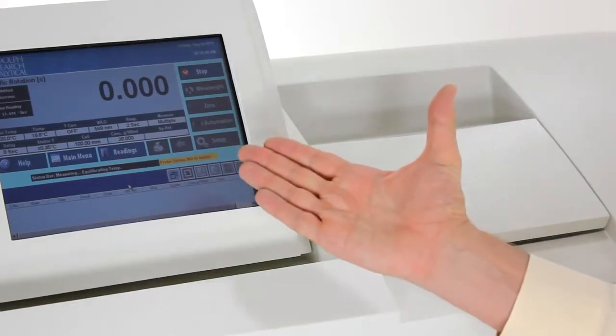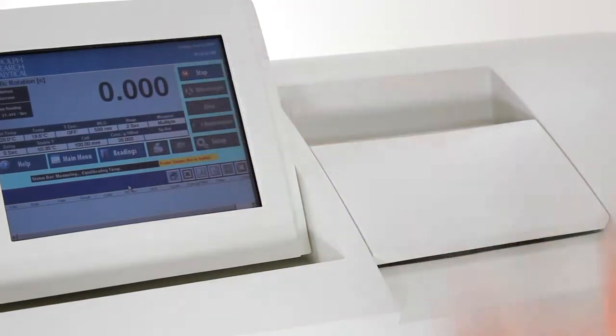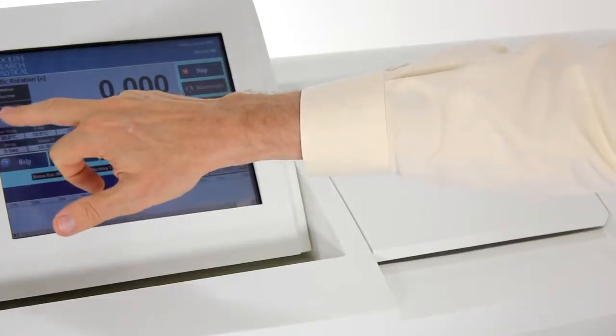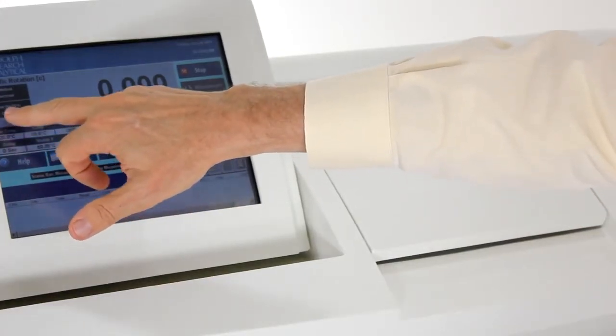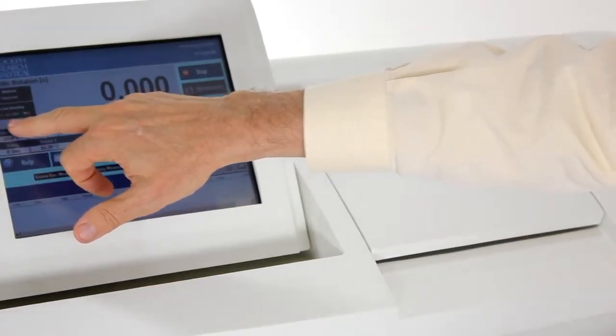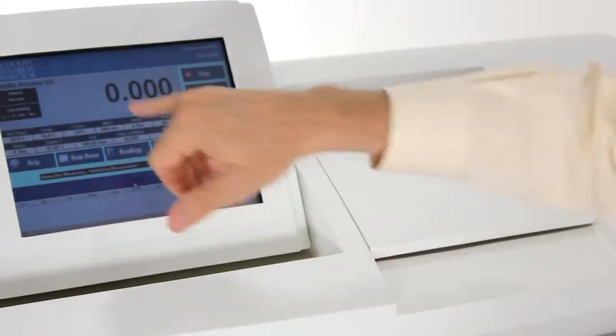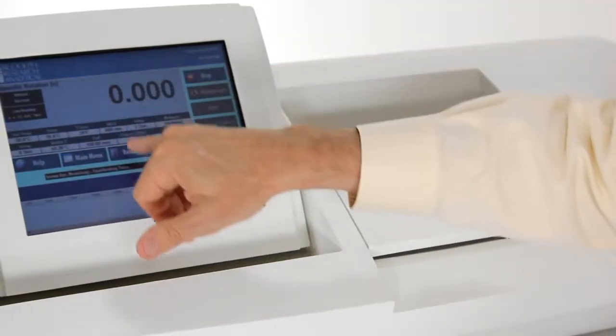When the sample is stable at the required temperature it will measure. It will measure the optical rotation and display this under the live reading. It will then calculate the specific rotation using the formula within the USP and display on the main screen. In this case we're just looking at the screen.